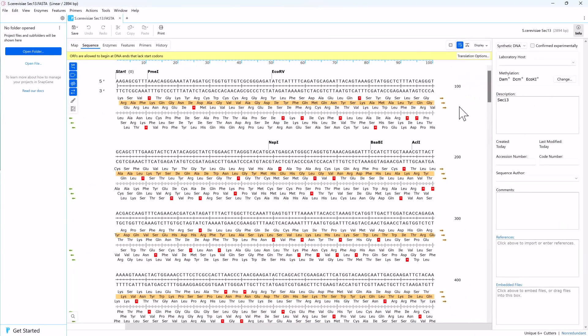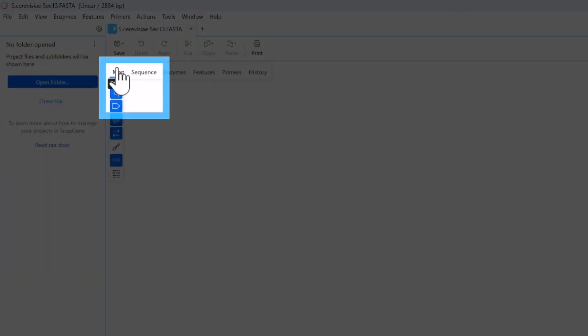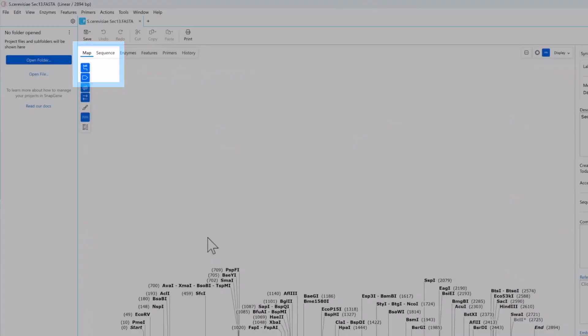You can convert any predicted open reading frame to a permanent coding sequence feature and save it with your sequence. To do this, switch back to map view.